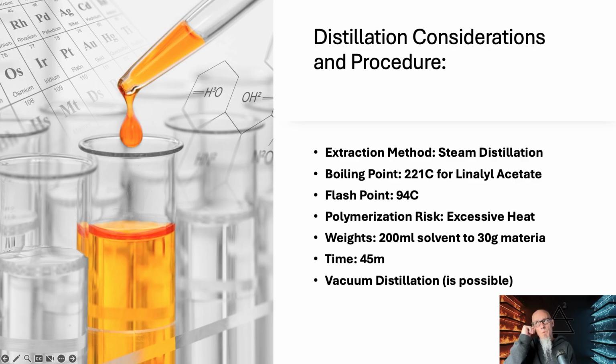And our boiling point of water is 100. I would say that we are 120 above, right? So we are well above where our boiling point for water is to where our product comes off, right?